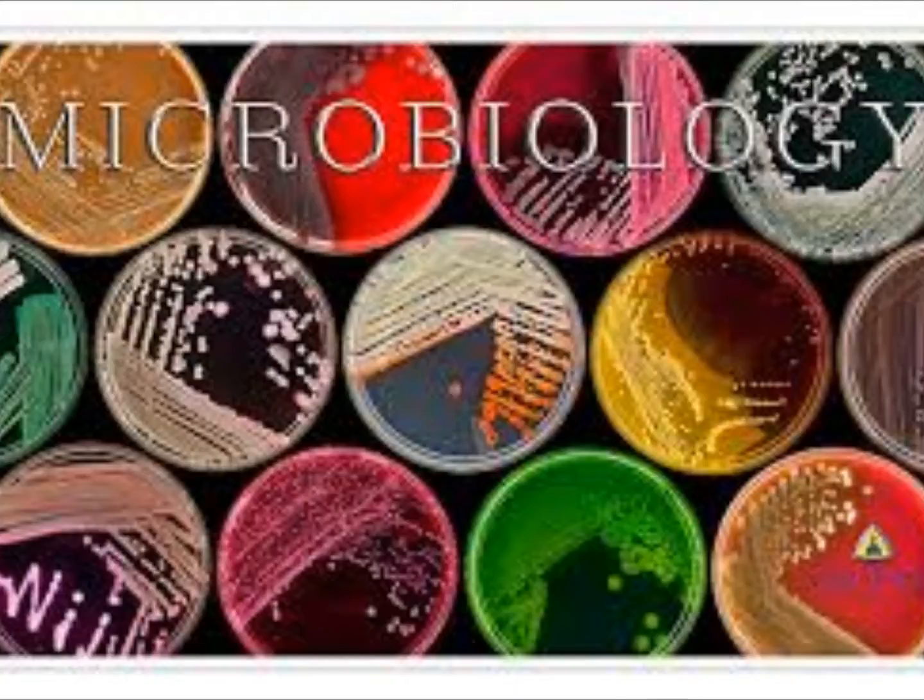Did we pass them around the first day? They passed around to different tables, so that way they can move down the sheet. You'll see when you get to a strep, some of those are clear. They almost look like water. They don't have a color, versus something white or off-white. Is anybody else evaluating their first 3 plates? Anybody else? No one's gonna get to do much on the plates today.